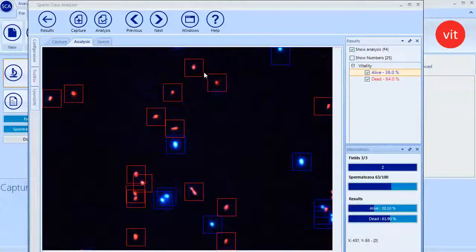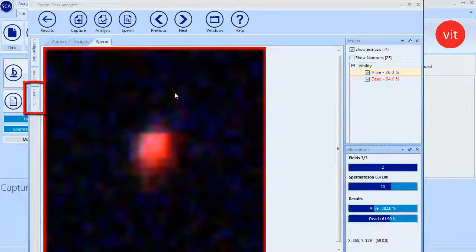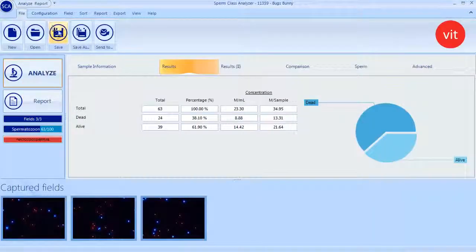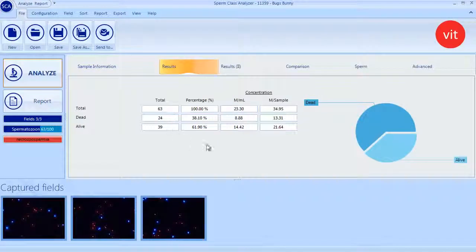Double click on a spermatozoan to visualize the individual analysis results in Sperm Info tab. Click on Results to close capture window. Results are displayed in table or graphic format in the analysis window.